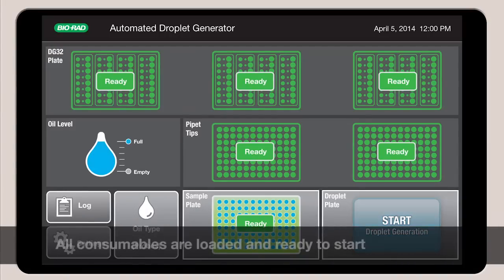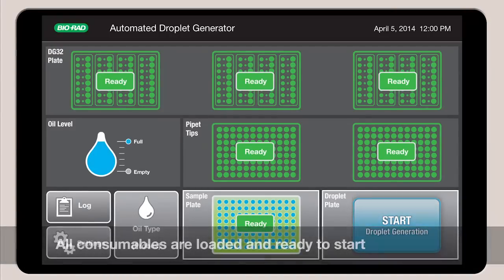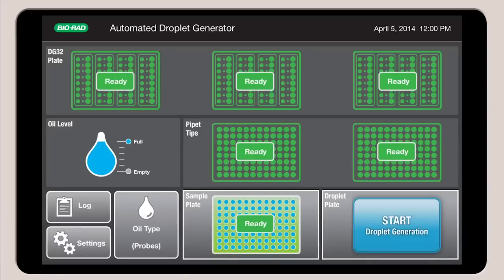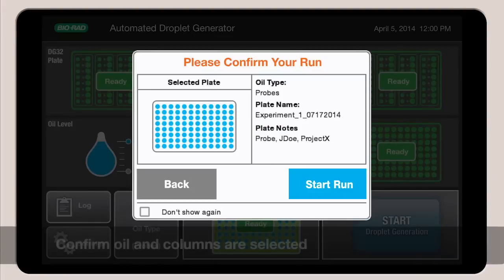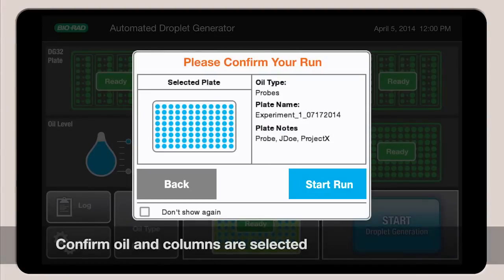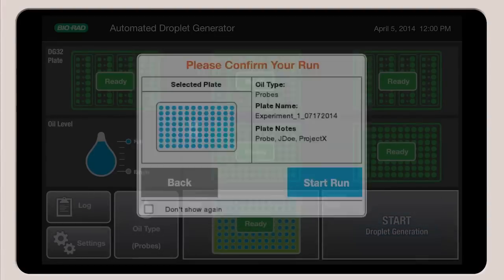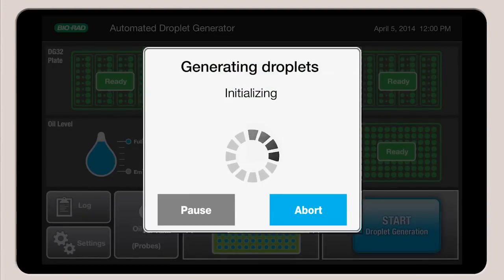When all the required consumables are loaded, all screen icons turn green and a start droplet generation icon appears. Confirm your run on the confirmation screen and you can walk away.